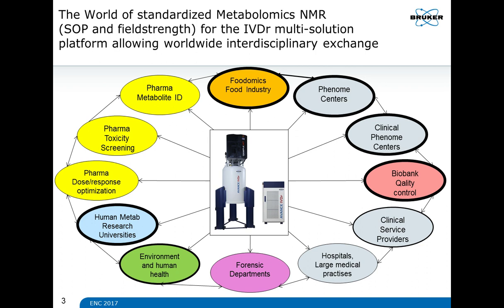And of course, there are quite a few groups to join this International Phenome Center network. And using the standardization that NMR provides here, they can actually exchange all their data. We also work on a biobank QC program that has just been released, which allows us to check the quality of specimens which are in the biobank, but at the same time to generate spectra and also analytical data, like quantification on those spectra, that can be stored in a biobank.